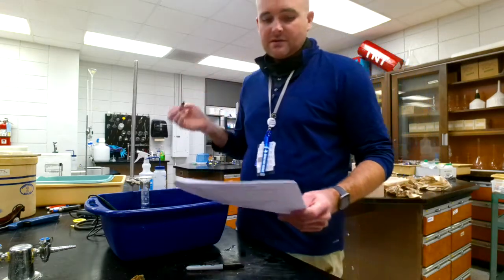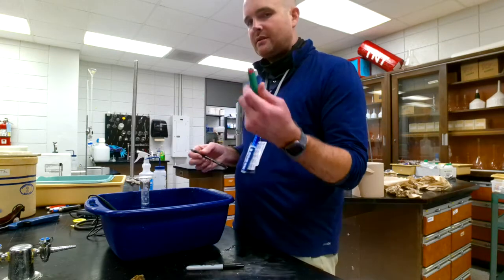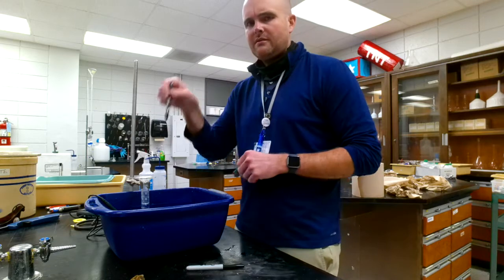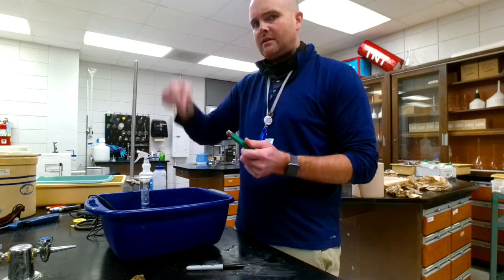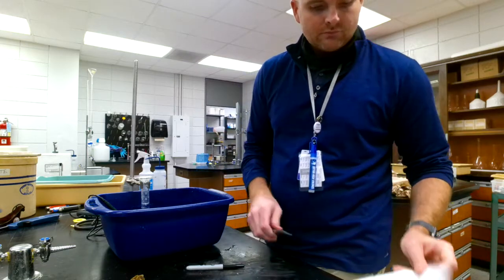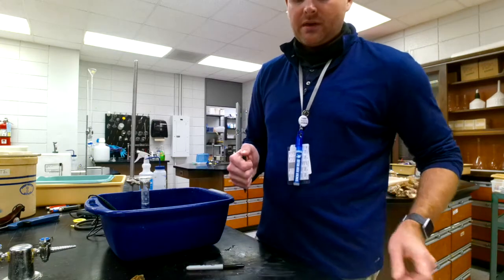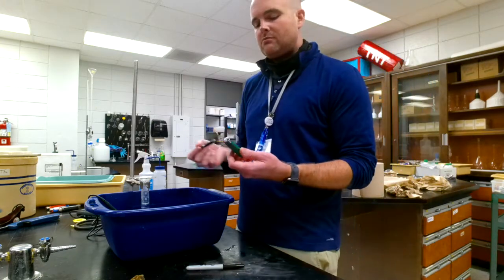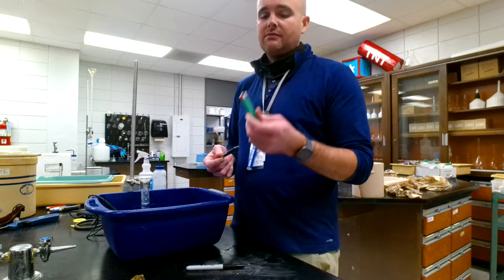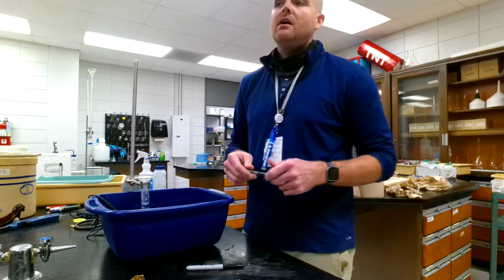Hopefully you saw 2 systematic errors that happened. I noted one earlier, because of the thing that was in the thing, right. Hopefully you got that. So what are some good remedies for that? You could produce your own gas instead of just getting it off a lighter. Maybe you could check that out.